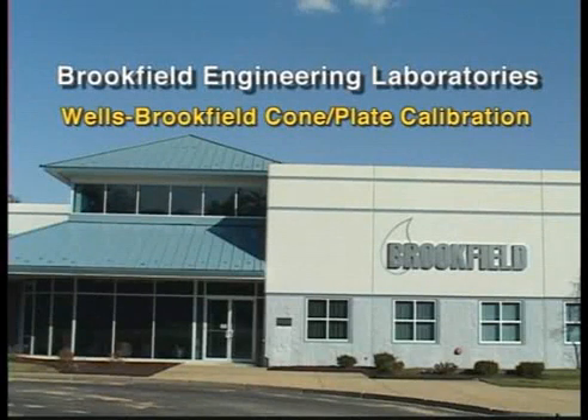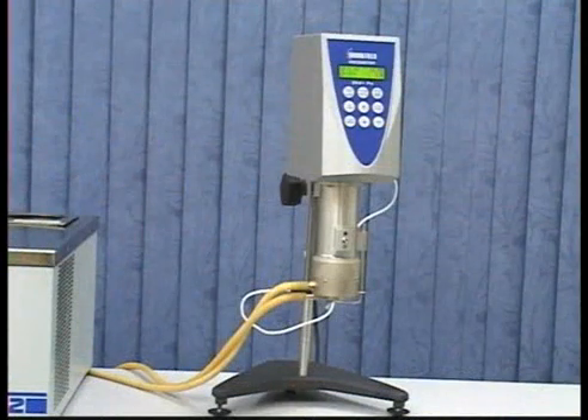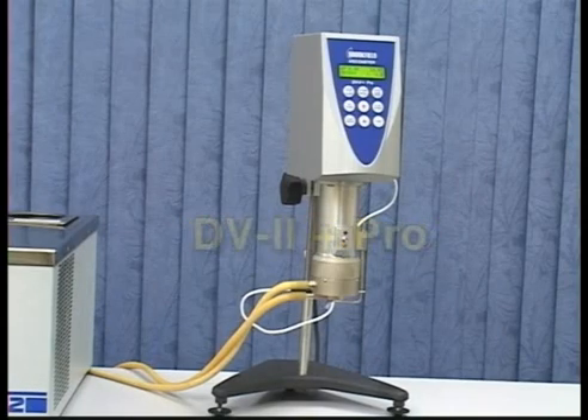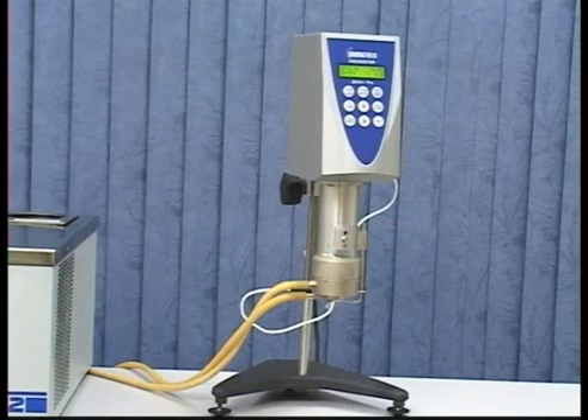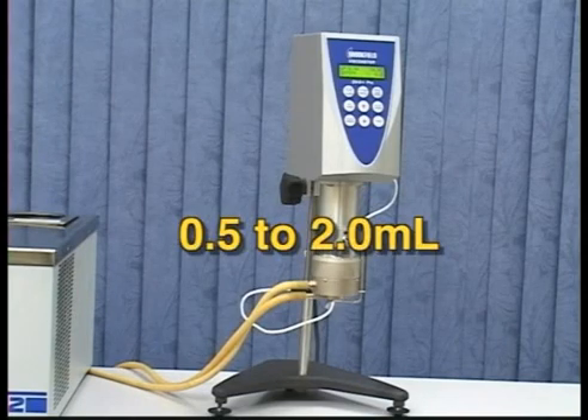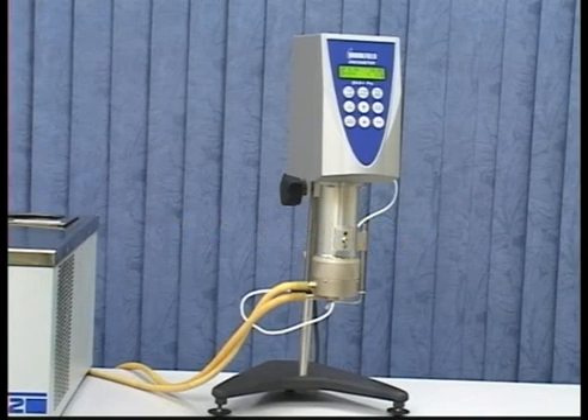This video will show how to set the gap and the proper calibration routine recommended by Brookfield Engineering for our Wells Brookfield Cone Plate Viscometer. The Wells Brookfield Cone Plate is an option available for the DV1 Prime, DV2 Plus Pro, and DV3 Ultra instruments. This configuration is for testing small sample amounts of 0.5 to 2.0 milliliters.